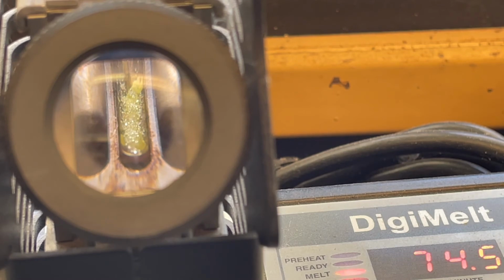If the solid material isn't sufficiently pure, we can technically crystallize it in ethanol. Look at that go.